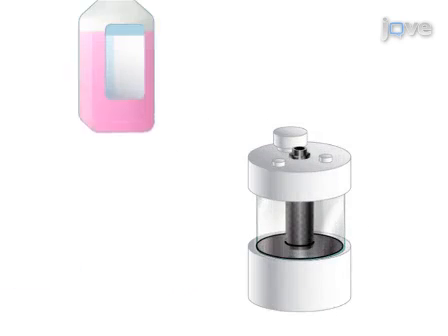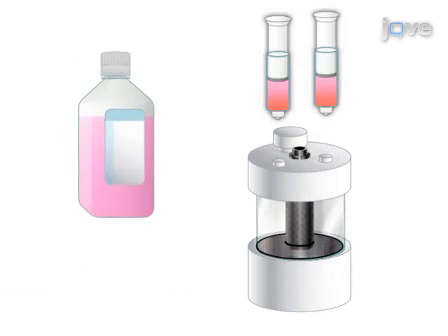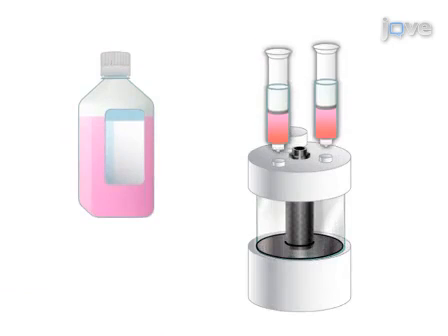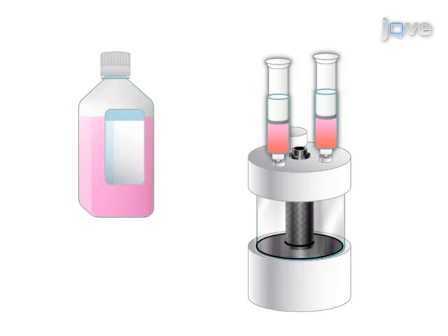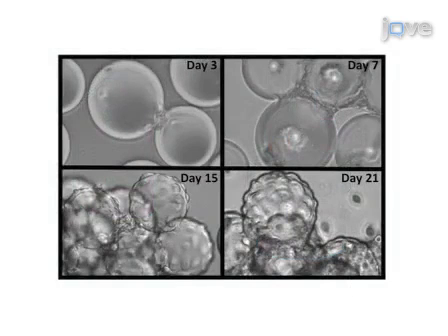After 96 hours, and approximately every day thereafter, replenish the media in the STLV to accommodate for cellular metabolism. Upon aggregate formation, image samples by light microscopy weekly to monitor developmental progression.